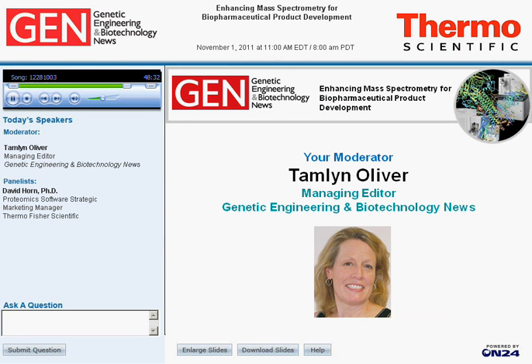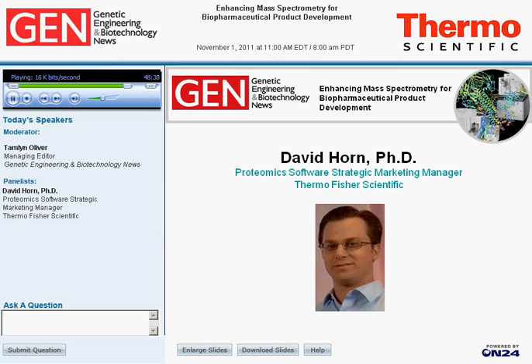I'm ready. Our first one is, can I perform these experiments with the earlier versions of OT instruments? Yeah, so we can perform intact protein analysis on previous versions of the Orbitrap instruments, and we have quite a few application notes and presentations that show that. I can refer back to the top-down paper from Pablo Bondarenko and colleagues at Amgen, and a number of others.